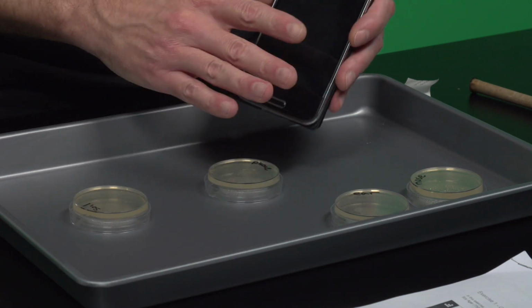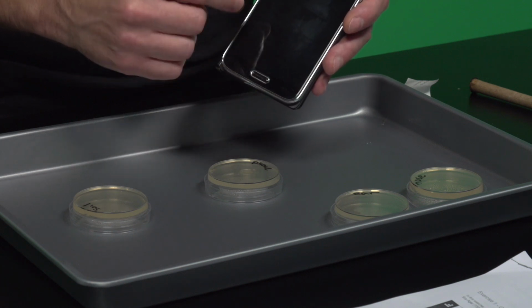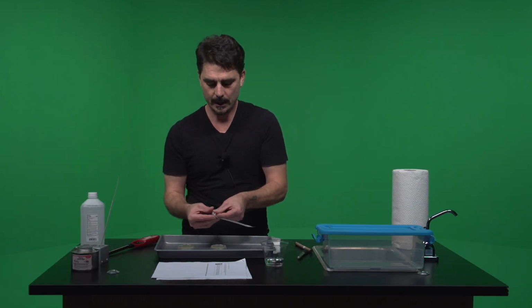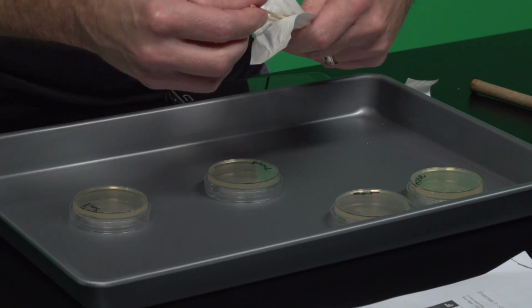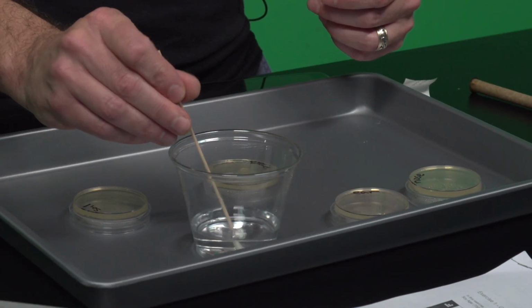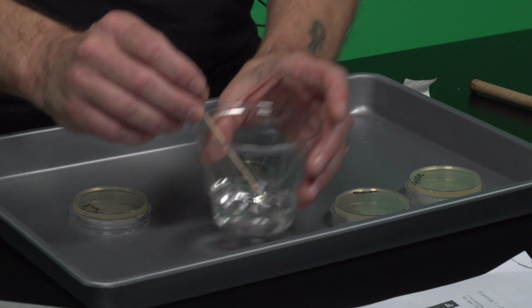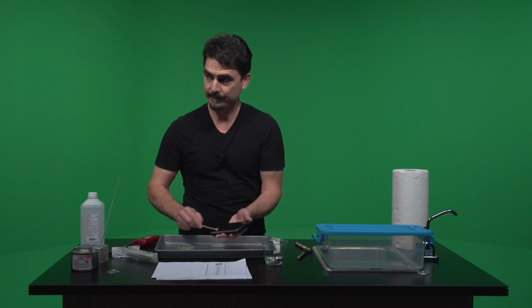Now, if you recently wiped down your screen with some isopropanol or something, good for you for doing that, but there may not be as many microbes on there. So for my phone, again, you make sure you don't open up the swab part. You open up the wooden stick part. You pull it out. And by this point, you should pretty much know exactly what we're going to do here. And again, the liquid here is so that your swab will be moistened and will pull bacteria off of whatever you're swabbing. So from that perspective, let's go ahead and see what my phone has.